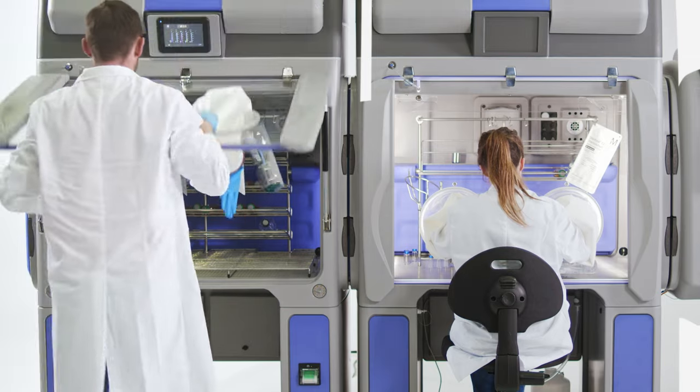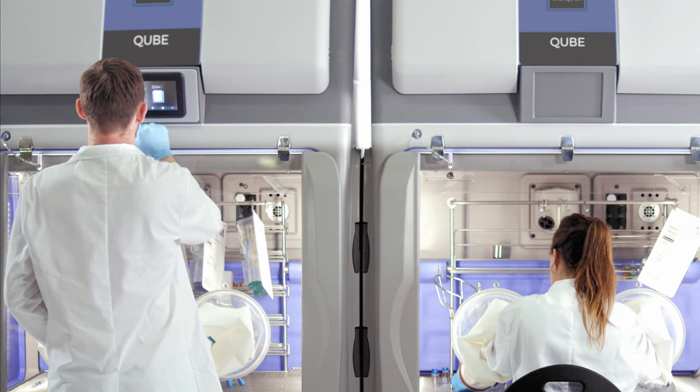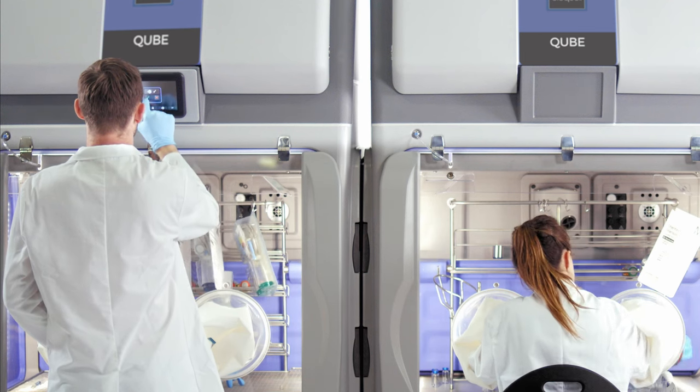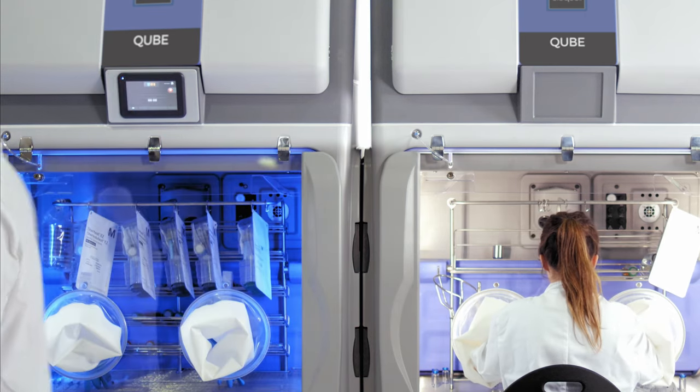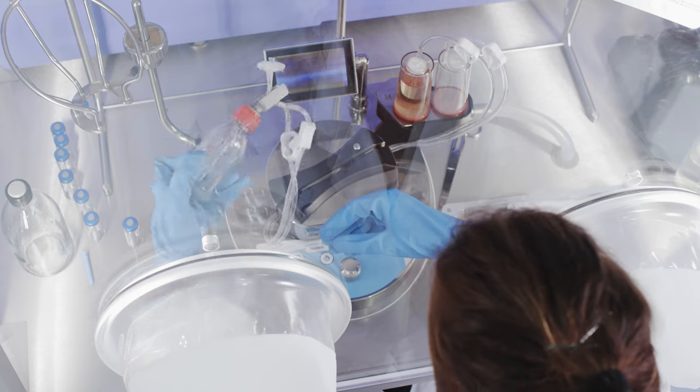With cycle times as low as 20 minutes and the capability to work in up to two modules while incoming supplies are decontaminated, the BioQuell Cube allows for a dynamic and highly efficient workflow.